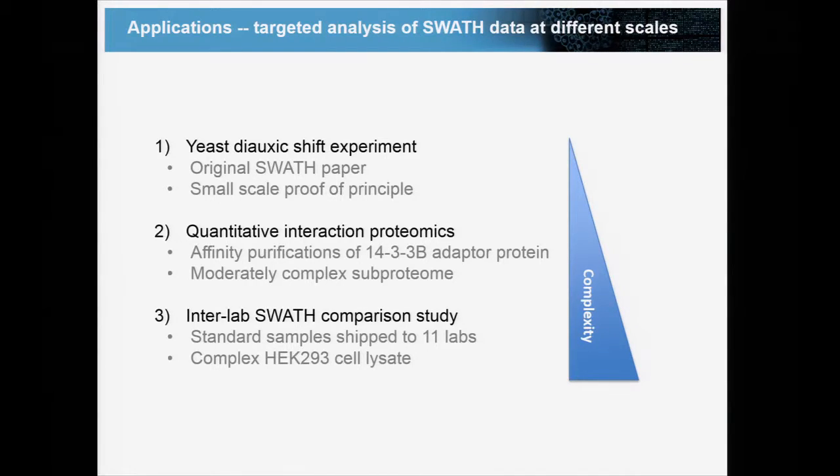They looked at some yeast data in a classical yeast experiment where basically the yeast are fed glucose, and then they eat all the glucose, and then they have ethanol to eat. So it's a metabolic change in the metabolic pathways of the yeast. This is a paper we worked on a couple of years ago where we were looking at interaction proteomics and protein complexes, which a number of people in the group were interested in.